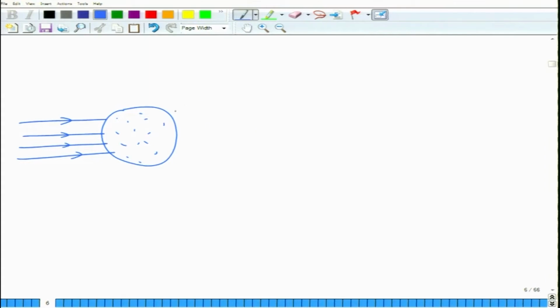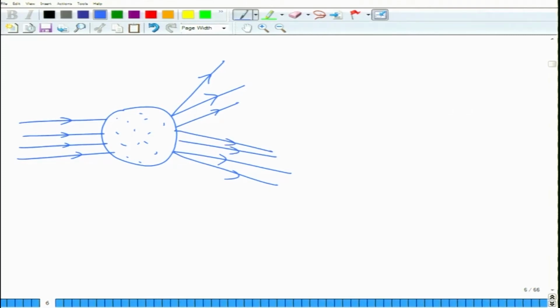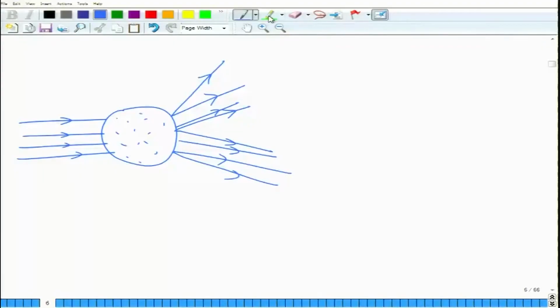So this will be the transmitted beam. With respect to the transmitted beam, you will have something going at this 2 theta, there will be some beams going at this 2 theta. There will be beams going at all the different 2 thetas because it is a polycrystalline specimen. As a result, the X-ray diffraction pattern that you will get is something like that. So this will give rise to a pattern which is achieved in this fashion.